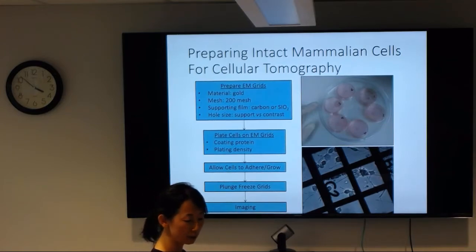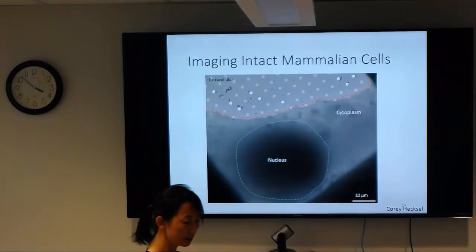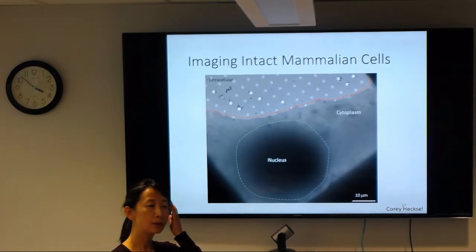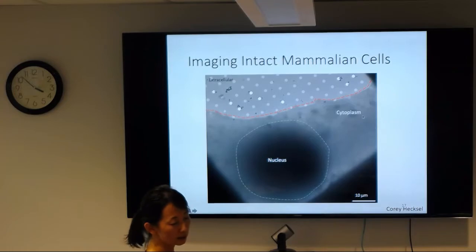And this is just a representative grid to show you. See, that's the cell body, and those are long processes extended out. And this is the cell, very standard, very representative. You can see the cytoplasm is relatively thinner. For the edge, this is the cell membrane.